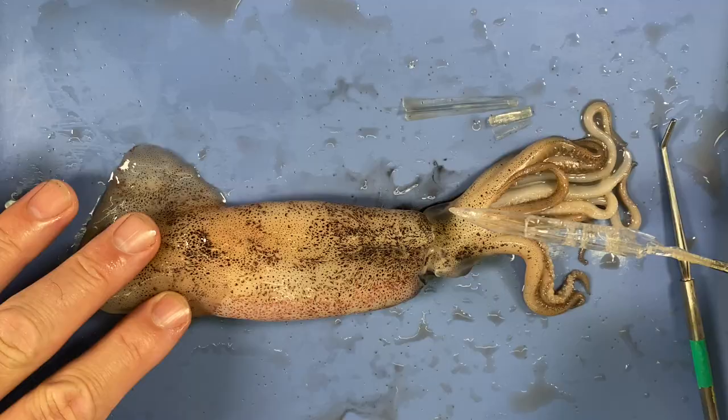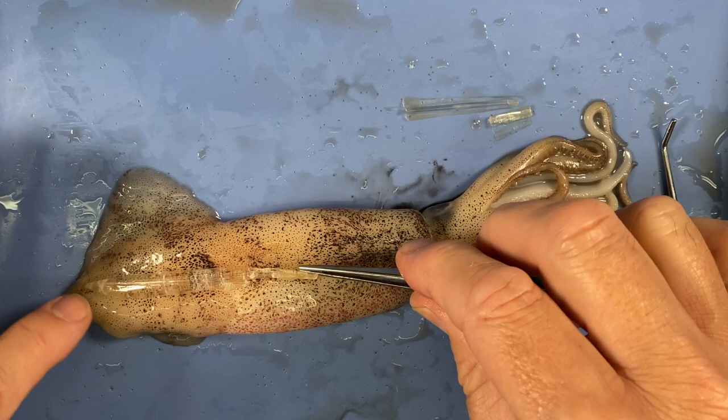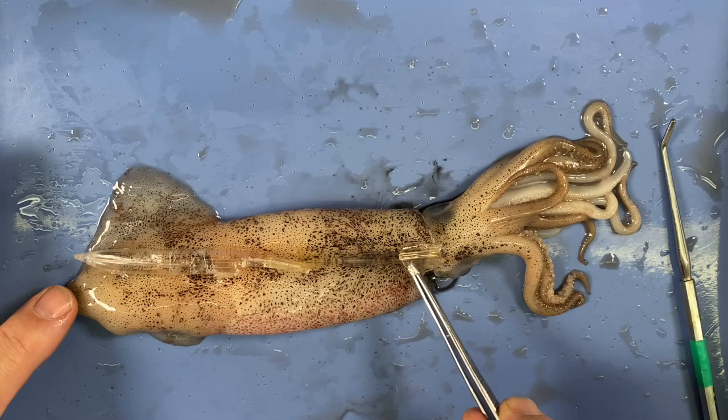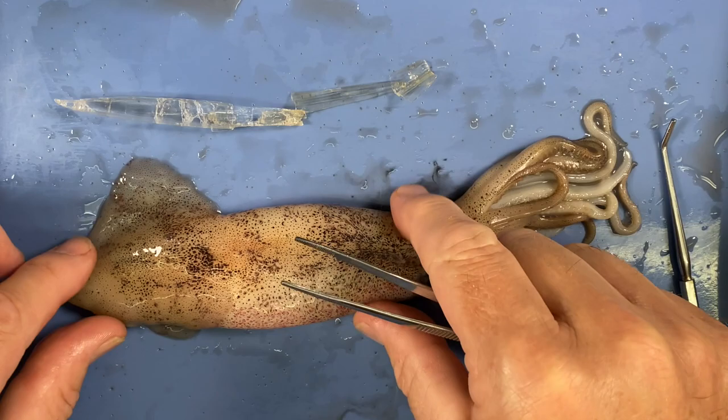This is called the pen, and it's a little bit like an internal shell. If I stitch all those parts together, it gives the animal some rigidity — it gives the mantle some rigidity. Now that it's removed, there's no rigidity to it — it's really very floppy. Next we're going to go into the mouth and I'm going to remove the beak, which is another hard part.